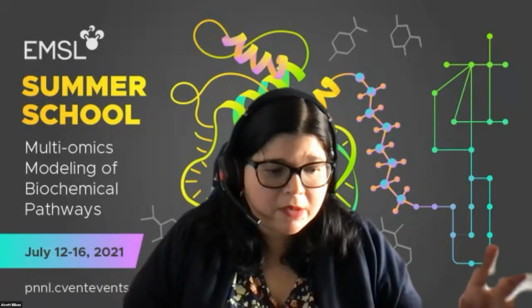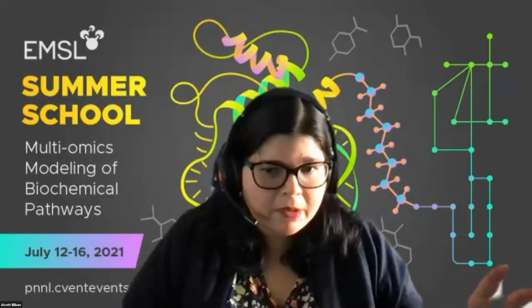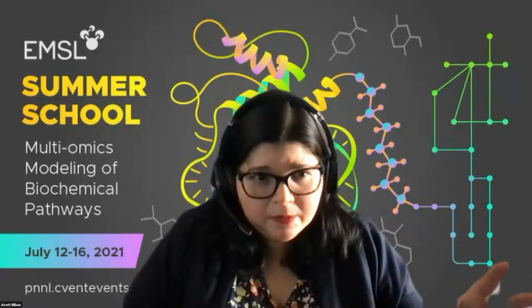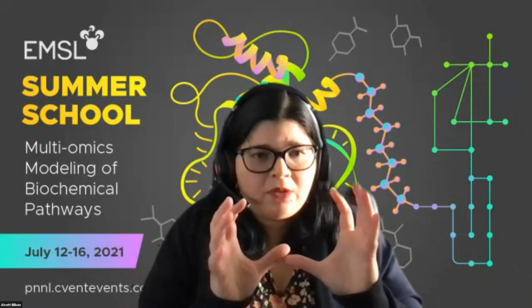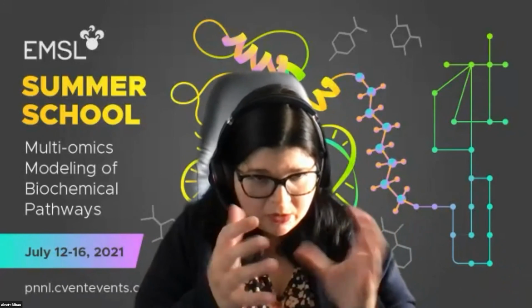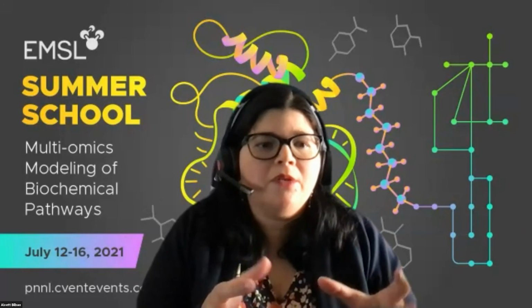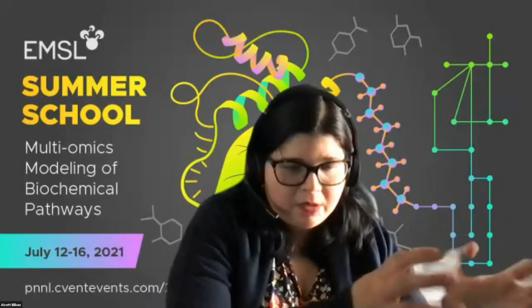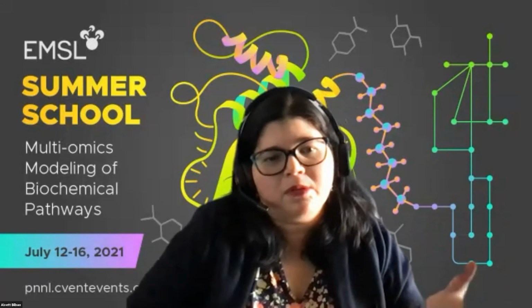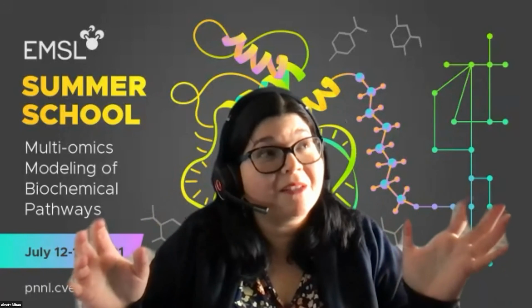You can study the intact protein, in what is called native form, which means closer to the structure that it should be in vivo, or you can try to isolate the protein and detect it denatured. So there are protocols that are different. I think both, I'm not 100% in vitro, but as close.